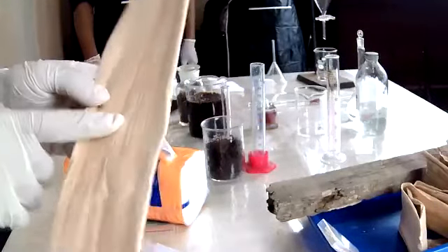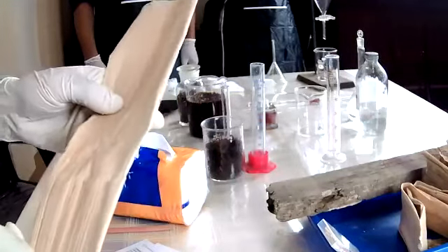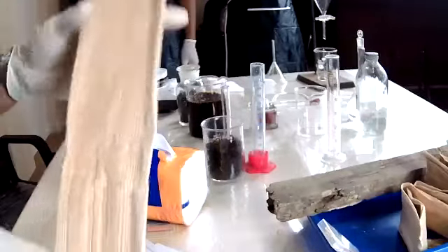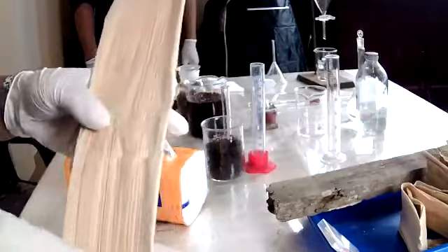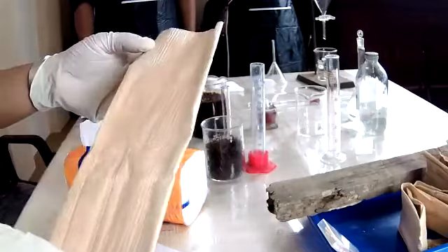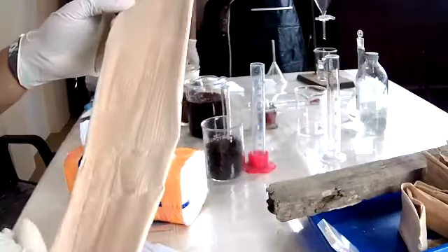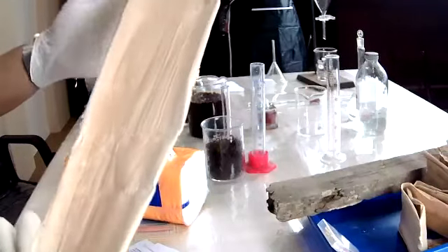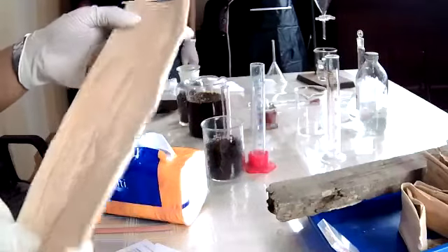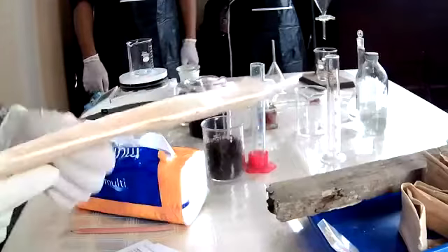So it is a package. So the tobacco and then the extract, the clove extract, and this dried stem or the dried stalk here, we used all of them and then ferment them together and leave it for a few days.